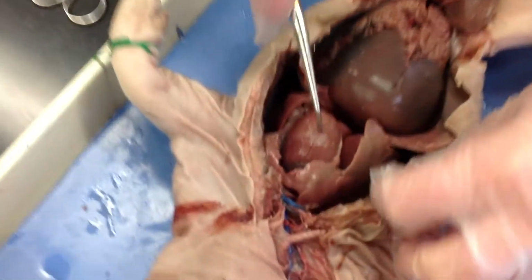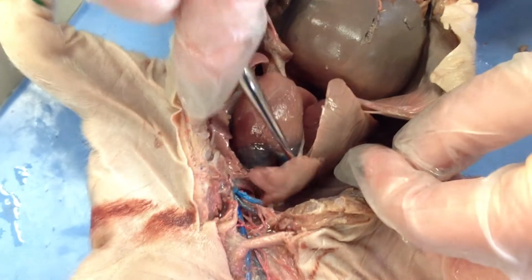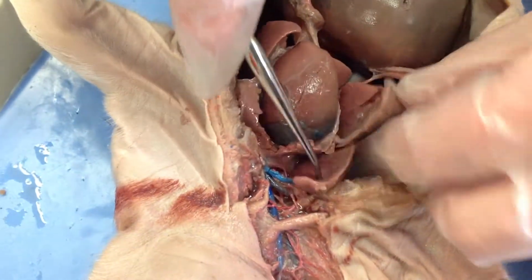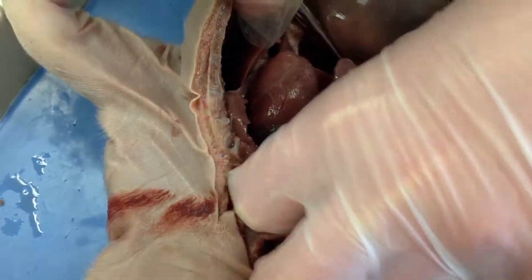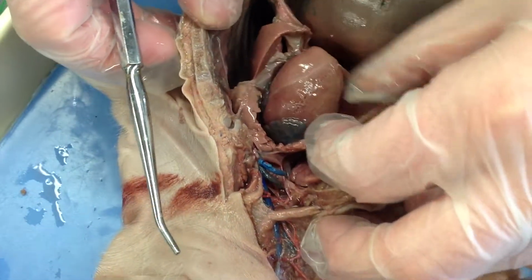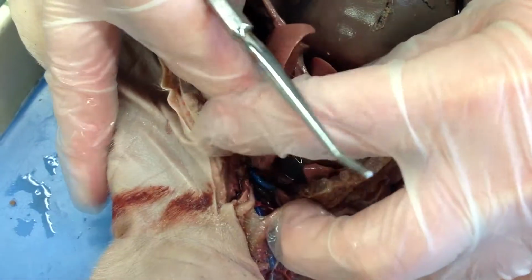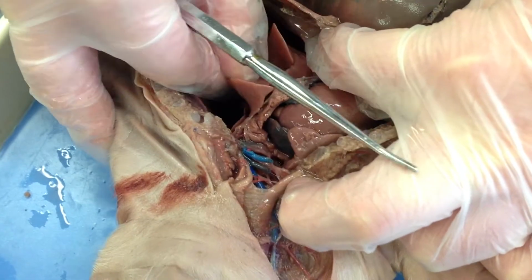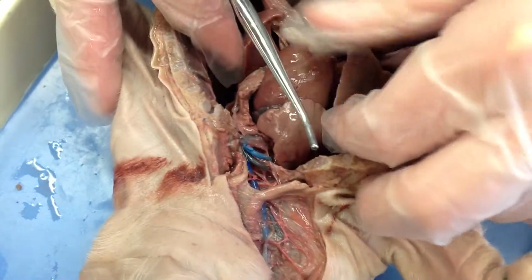Okay, in the thoracic cavity, we can see the lungs. These are the lobes of the lungs here. It's the right lung. I see 3 lobes here, and there are fewer lobes on the left side of the thoracic cavity. The left lung has here 1, 2, 3, so I guess it's probably 4 lobes on the right side and 3 on the left.